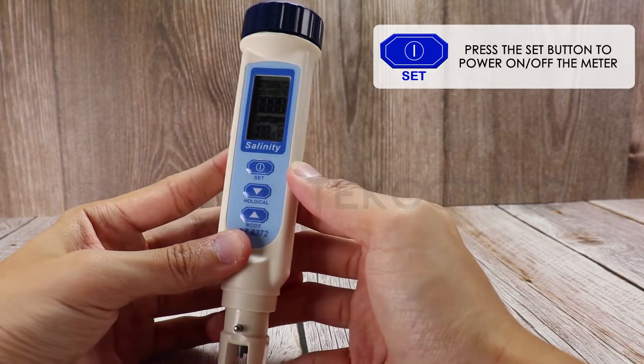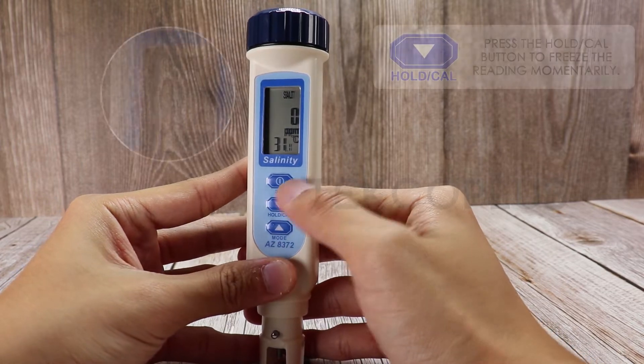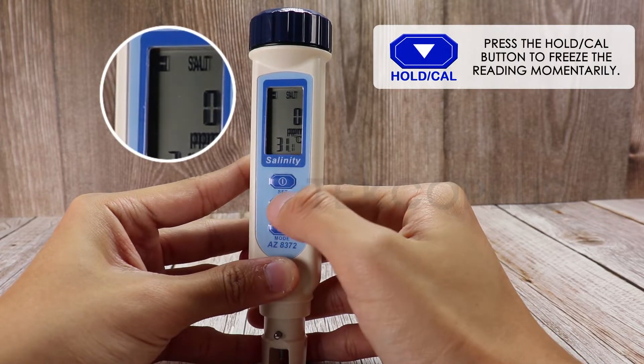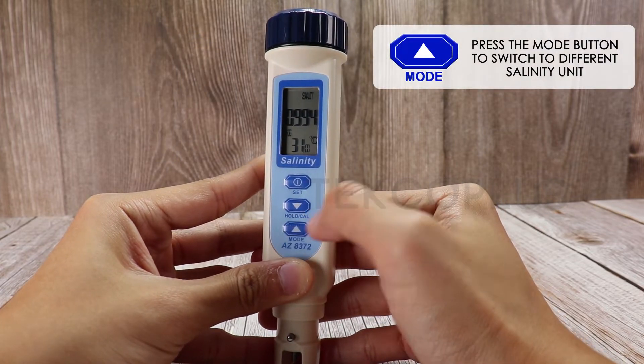Press the SET button to power on or off the meter. Press the HOLD/CAL button to freeze the reading momentarily. Press the MODE button to switch to a different salinity unit.